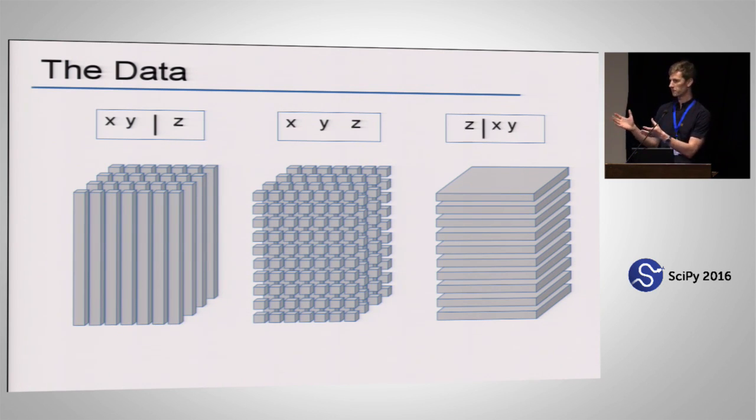The x and y, the frame axes, are the important ones, and the z only selects the time you're interested in the movie or the slice in a 3-dimensional data cube. Actually, in the middle case, none of the dimensions are important since they only specify the location of that particular number that you are interested in this way that I've drawn the data over here.